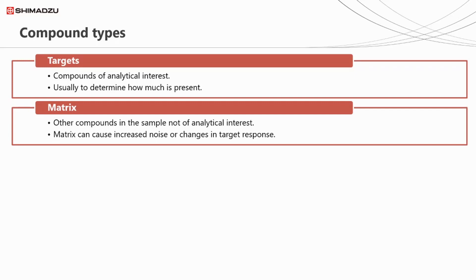We need to be aware of matrix, as it can cause increased noise in our baseline, or even alter a target's response. In environmental analysis, matrix often boosts the response of some pesticides by blocking active sites in the inlet and column, which some pesticides get stuck on.